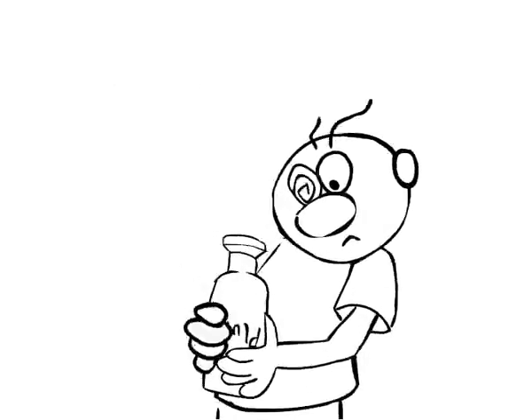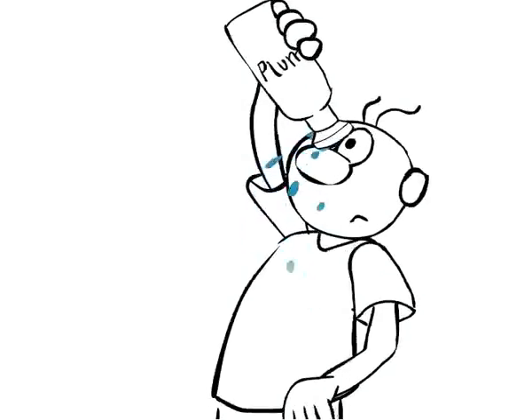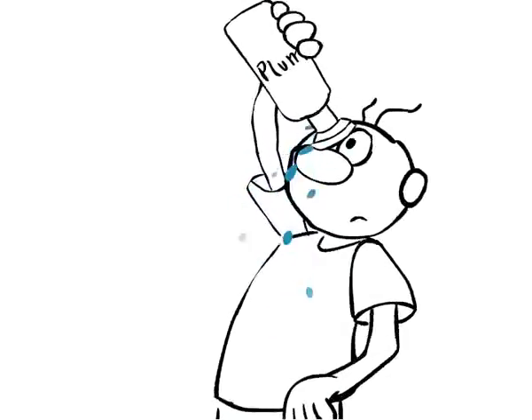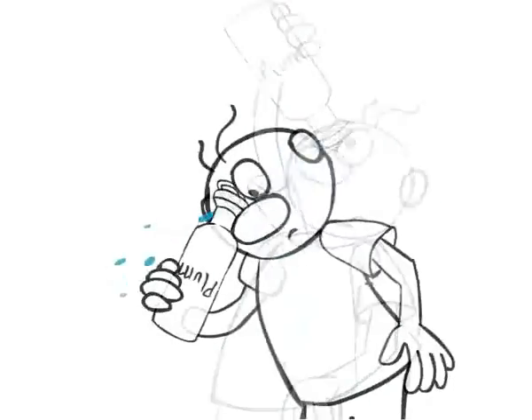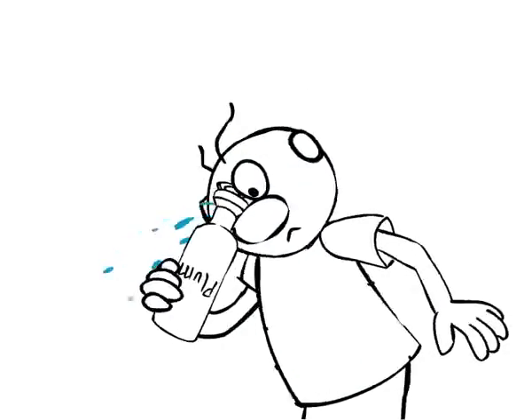Two simple steps and the bottle is ready for rinsing. The ergonomically designed eye cup ensures easy and direct rinsing and leads the fluid away from the eye again. To avoid wet clothes, you can also rinse while leaning your head forward and squeezing the bottle gently.